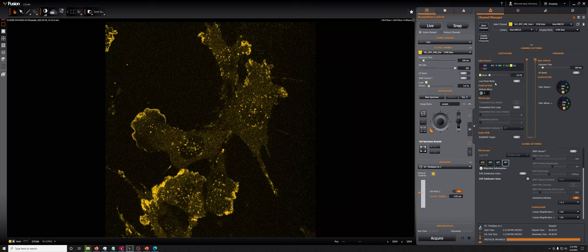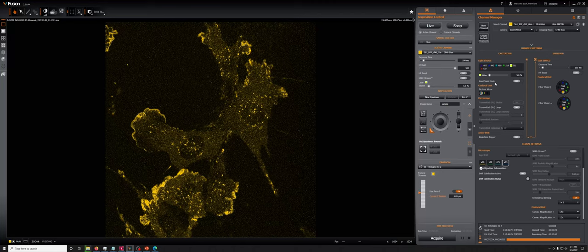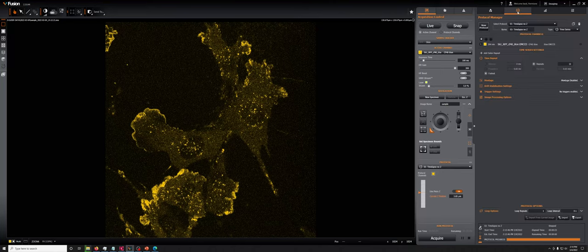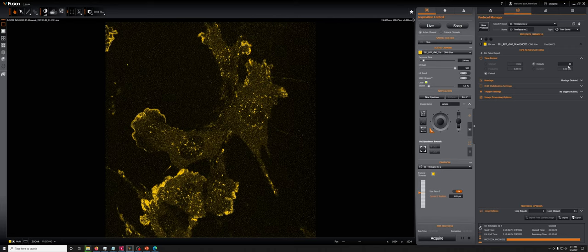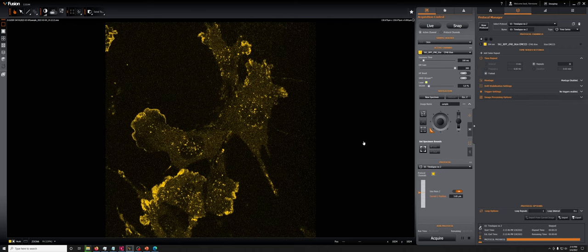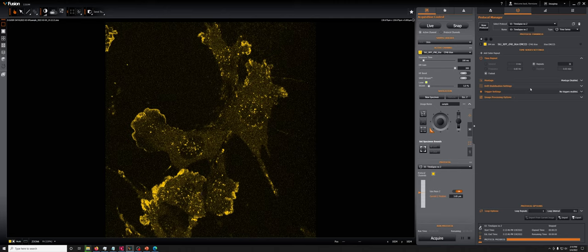Before I get into this, let's just get a sense of how fast is the camera under normal circumstances. If we just look at a time-lapse protocol and we just take 11 repeats, if you look here, since we have an exposure time of 100, if the camera didn't have any extra time every time it took an image, this should take one second because there's no additional time for the first frame.